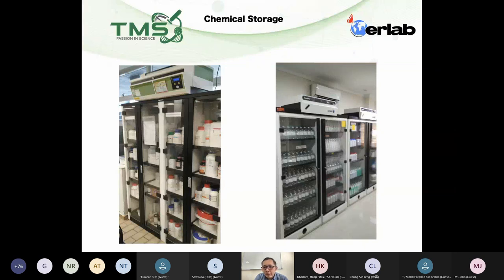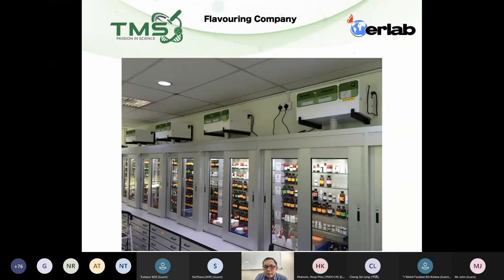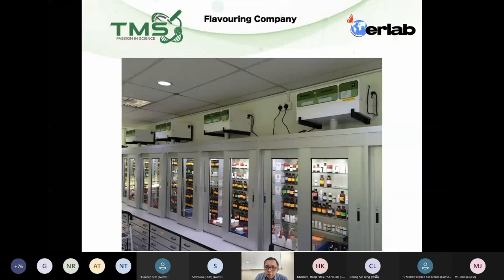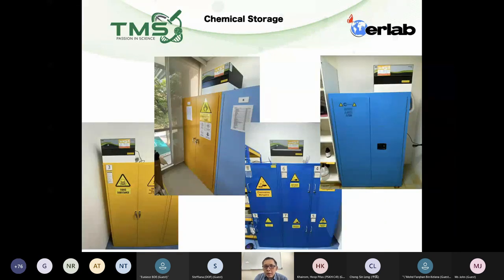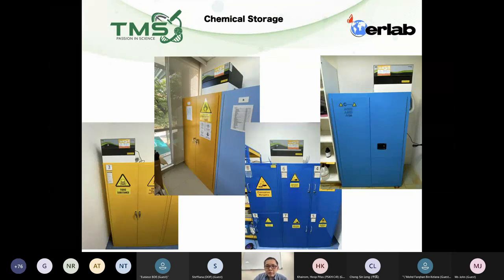This is also an example from a flavoring company — they're not concerned about chemical hazards but about smell, so we installed a filtration system for them. This illustrates the chemical room storage I mentioned earlier with a filtration box. A filtration box is more practical than a ducted system when the building is already built, and it's the most economical option when adding additional flammable cabinets.